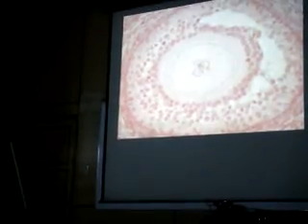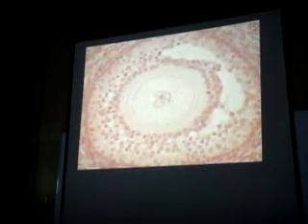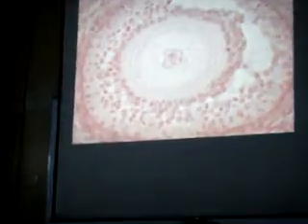Because even if, for example, you were able to recognize that it's an epithelial tissue, a connective tissue, a bone, a cartilage, a muscle, or a nervous tissue, as long as you have recognized that it's the correct tissue, you will get what? Half credit for writing that it's an epithelium, a connective tissue, a bone, a cartilage, a muscle, or a nervous tissue.